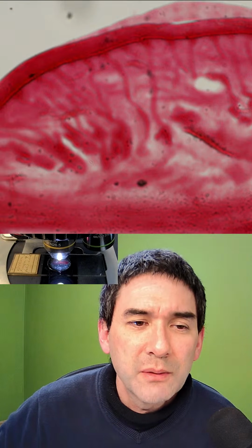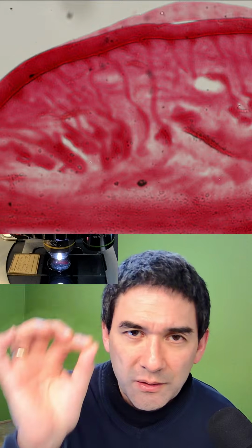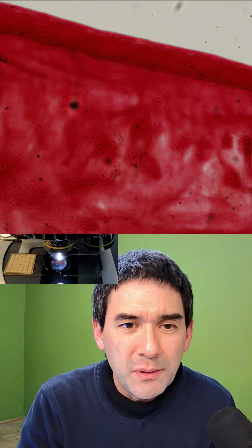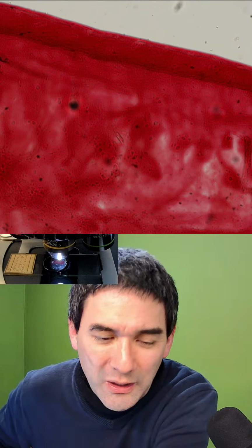These seem to be some kind of either sweat glands or so. Yeah, those lines that you see with the little glands which are going out to the surface of the skin. So it's, how do you say, an interesting specimen, but not quite as revealing to look at.